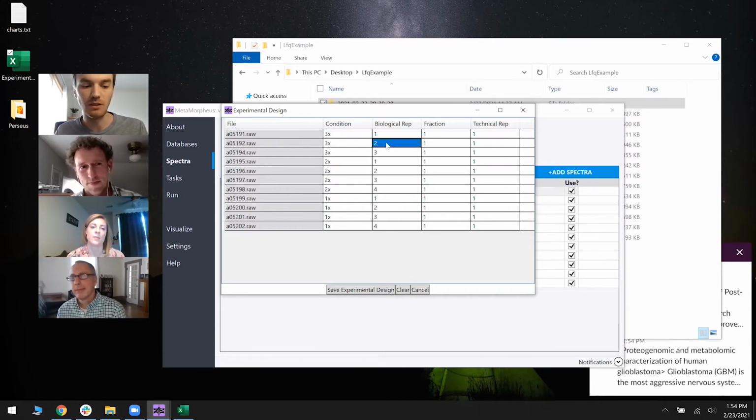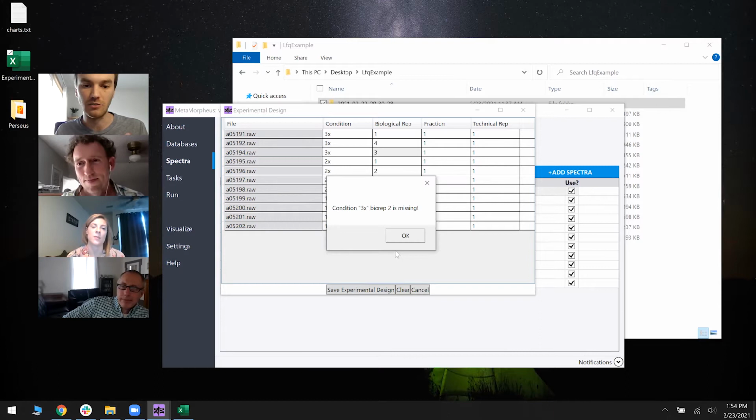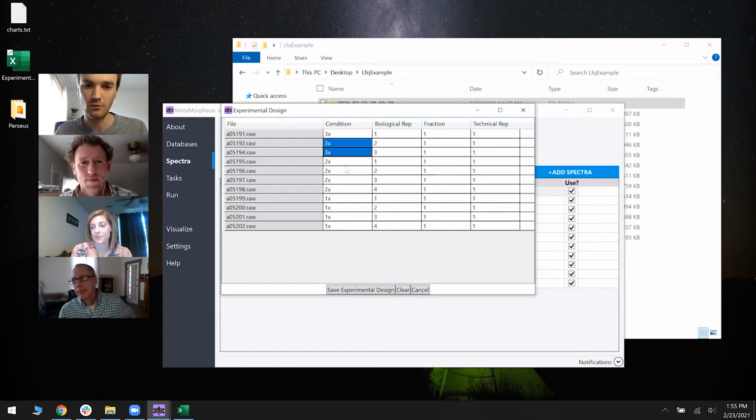And if you do mess something up, let's say you accidentally put in a 4 or something, and you try to save it, it'll tell you biological rep 2 is missing in condition 3. So it was expecting a 2 here. The condition can be named anything. It's just a string. There's no format needed for that.